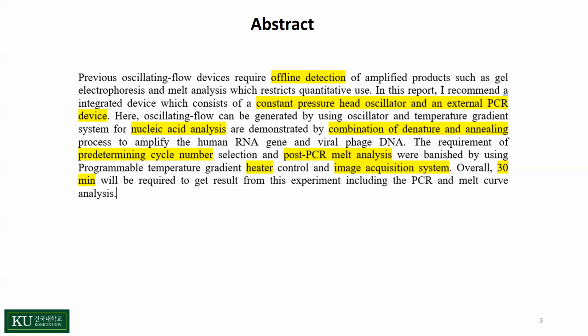By using this device, we can easily determine the fluorescence intensity emitted after amplification of viral DNA or viral RNA by using proper PCR mixture. And we can also count the cycle number or do melt analysis with the experiment.